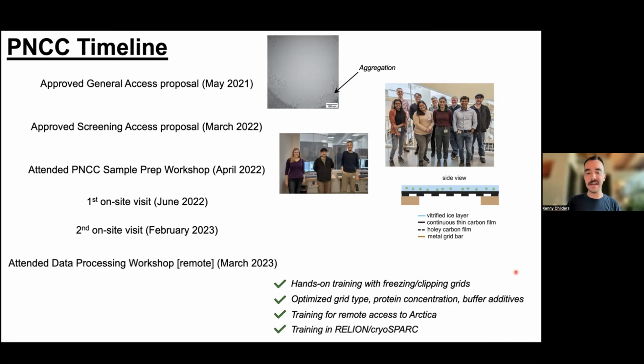After that, I attended a data processing workshop, because up until this point, I'd really been bumbling around by myself, processing data and trying to figure out how things work. So Omar got me into this data processing workshop that I attended for a week remotely, and that helped train me on using Relion and CryoSPARC, which again is provided through PNCC.